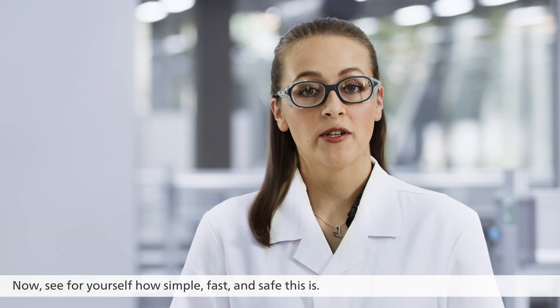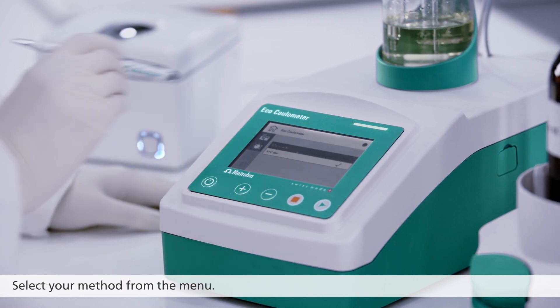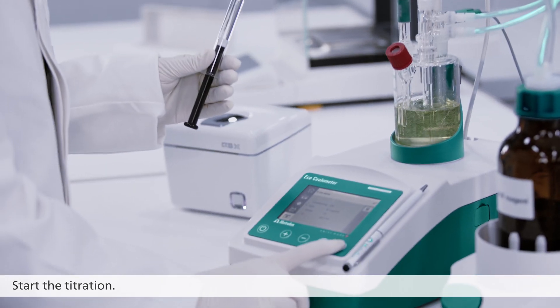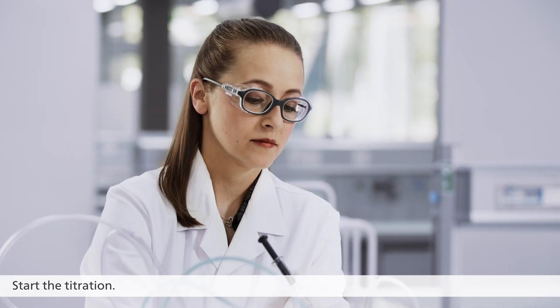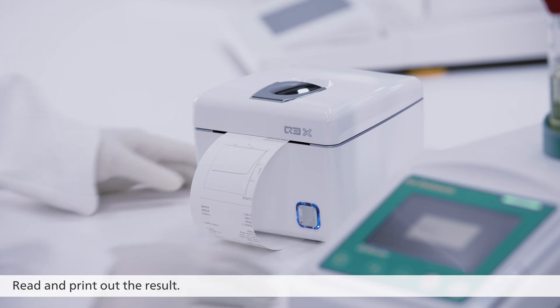Now see for yourself how simple, fast and safe this is. Select your method from the menu. Start the titration. Introduce the sample. Read and print out the result.